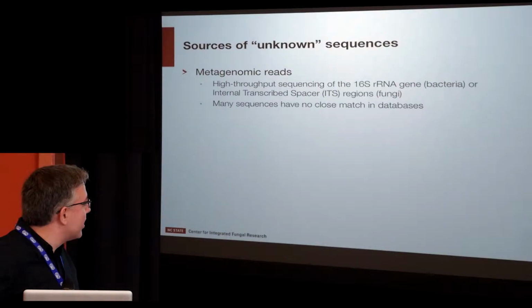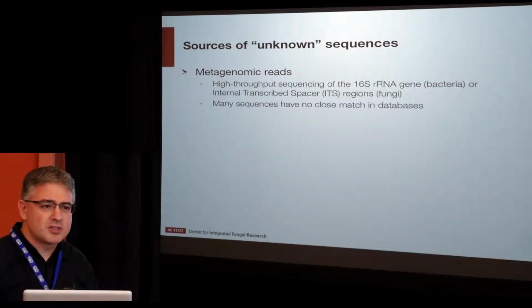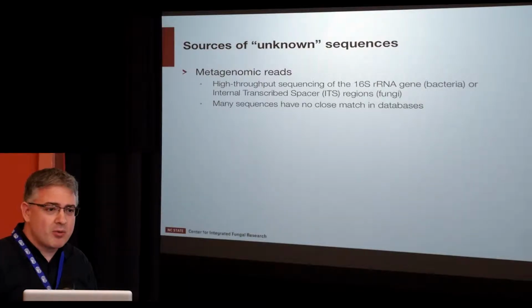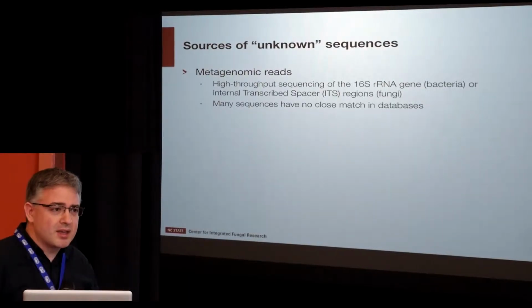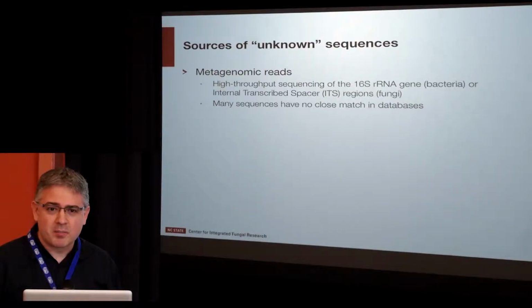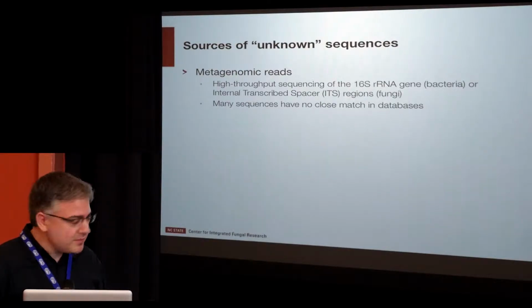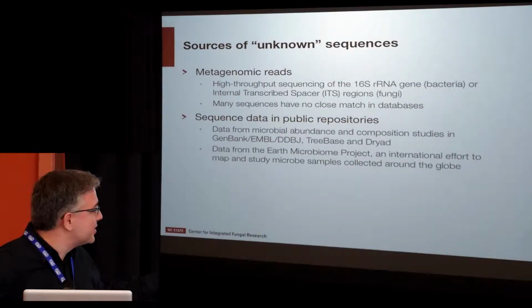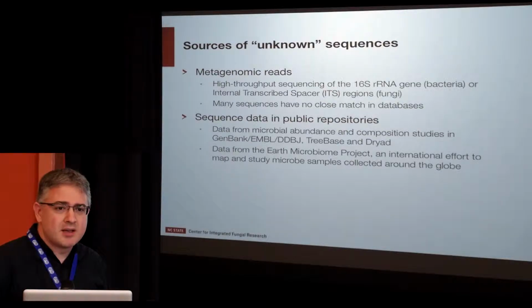You're all familiar with metagenomics. This generates a huge number of sequence reads. And you may be aware that many of these have no close matches to anything in existing databases. And what happens is we just throw them out. It's convenient because we don't know where to place them, and there's no good mechanism or approach to place these right now.